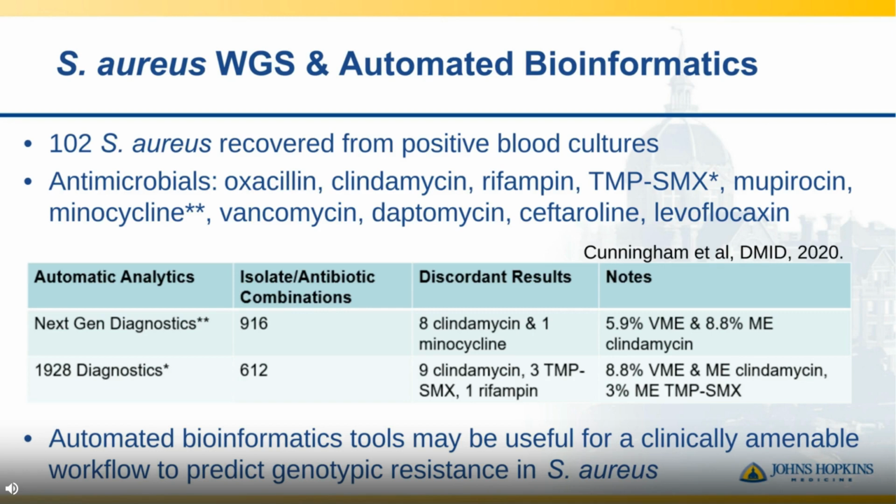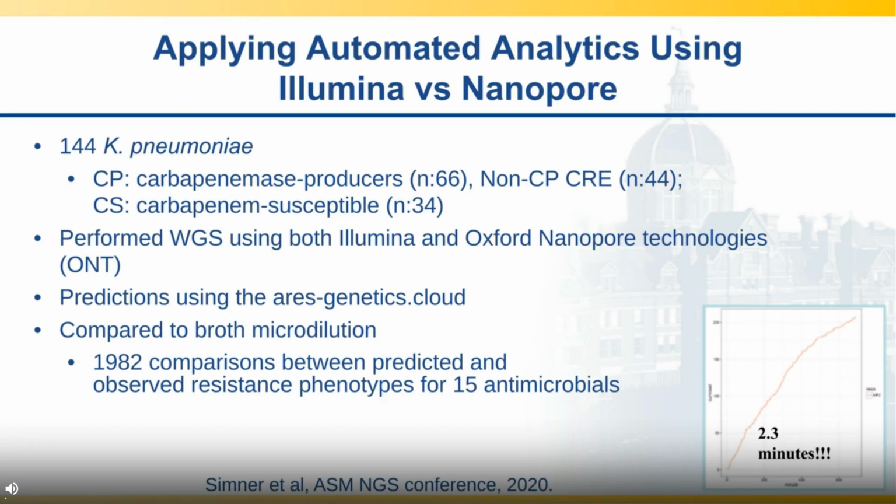Now these studies have been applying Illumina-based technologies, and what we wanted to do in our research lab is see, can these analytics handle Nanopore-based data, because Nanopore-based data can be produced, as we said, in real time, has the potential to be available to impact patient care. However, what I find most of the time is that some of these programs are developed specifically for Illumina data and cannot be directly applied to Nanopore data.